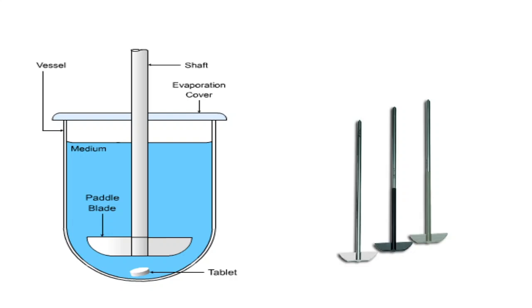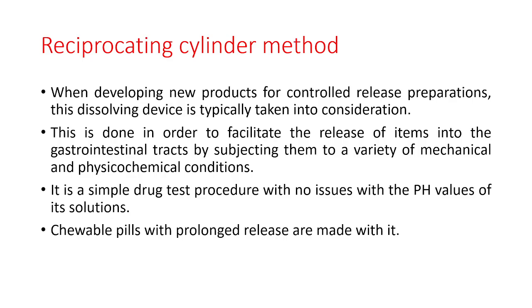And this is the image for this paddle method. We have placed the tablet inside, and the paddle blade is there and it is connected with the shaft. You can see the paddle structures.